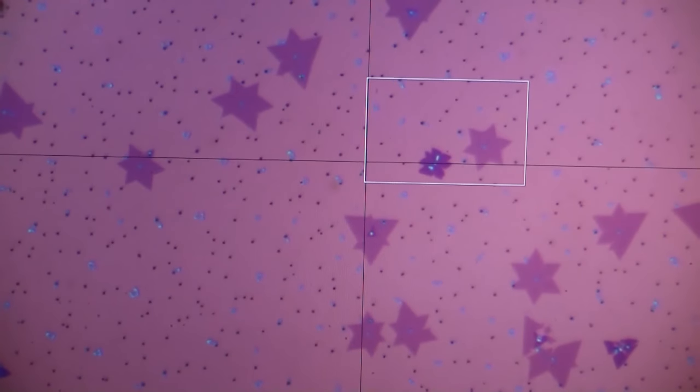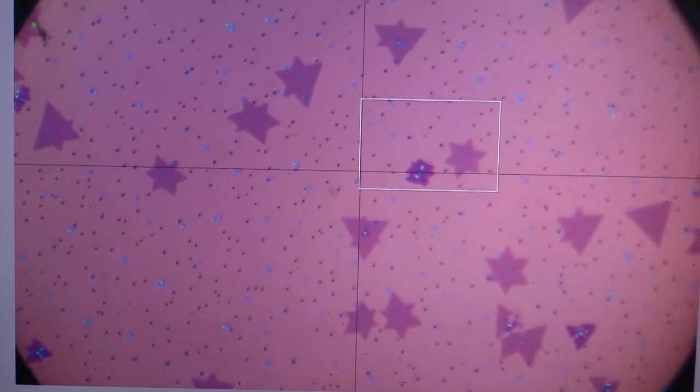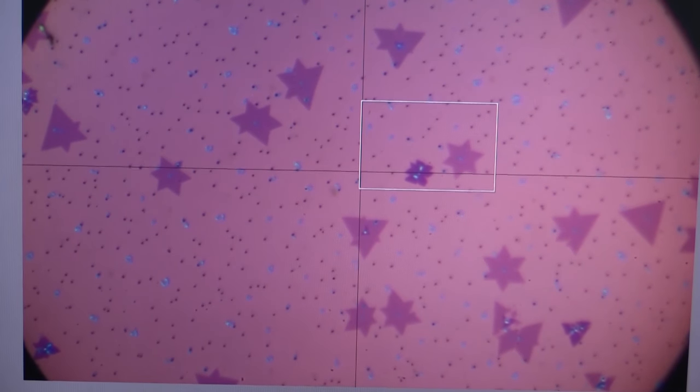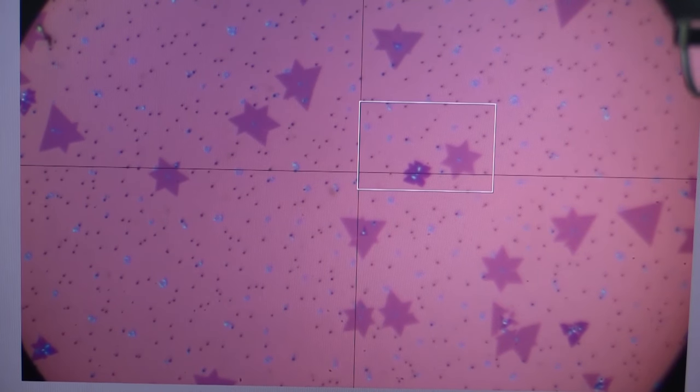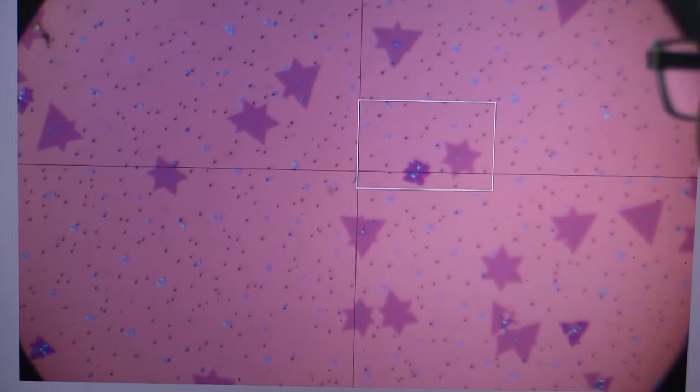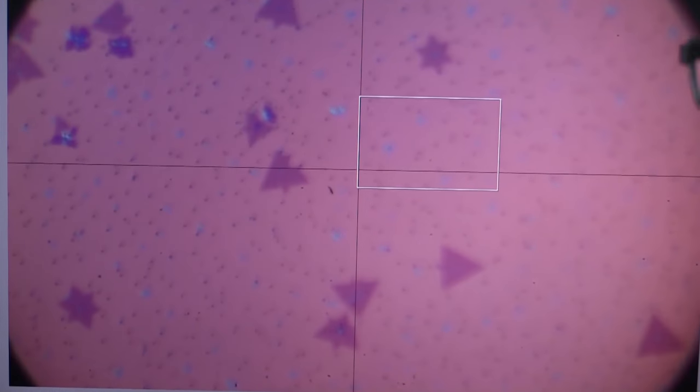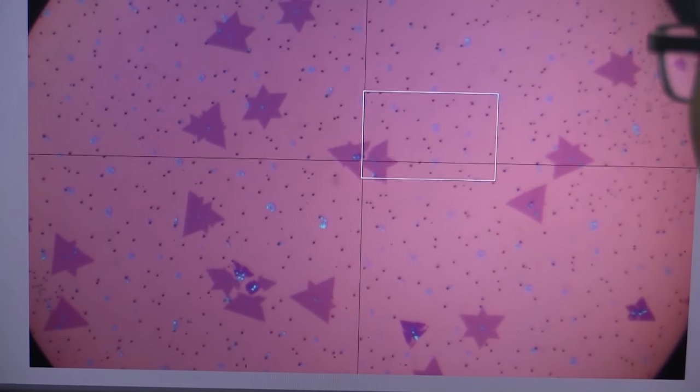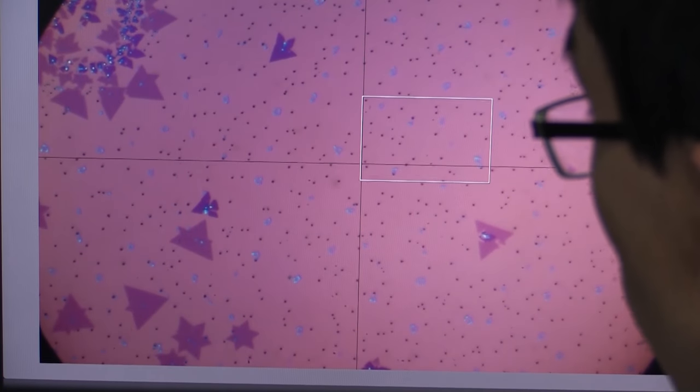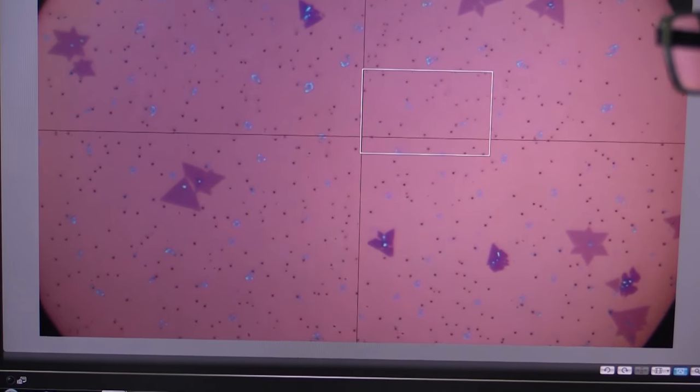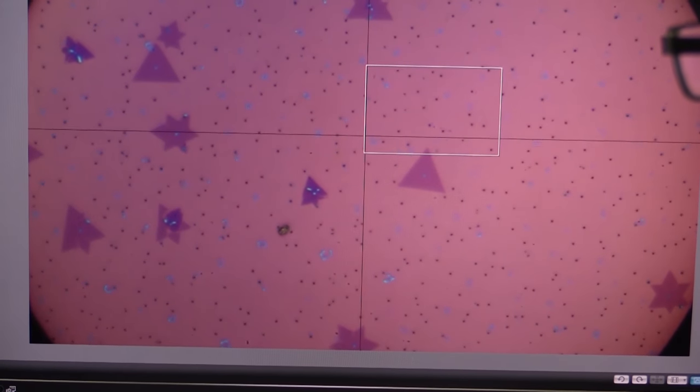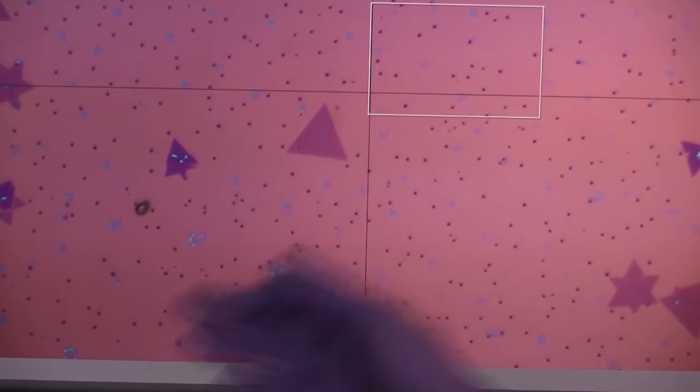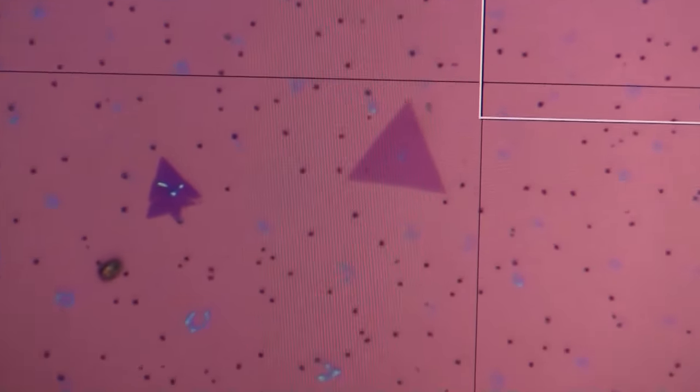We see relatively high nucleation from these little spots. That can be controlled with either the gas flow rate or the source quantity. But overall, growth looks pretty good. Here we see many very nice triangles, which is the optimal structure for these crystals at this size. Here we can see a crystal that's about 35 microns across.